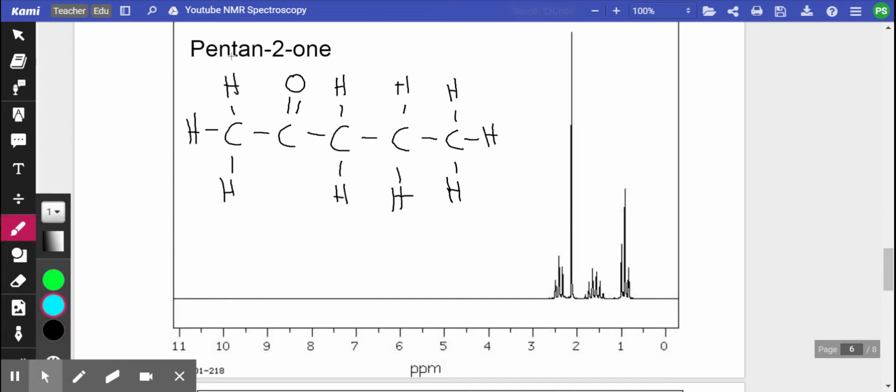For example, these 3 are one hydrogen environment. Now you might think that the CH3 group on the other side looks very similar, but it's not, because it's not close to an oxygen, and therefore it feels a different magnetic field than the hydrogens here that are so close to this carbonyl group. So this CH3 group will appear higher on the scale, on number 2. For example, it's this one here. I'll mark it with blue. Okay, let's put a 1 there.